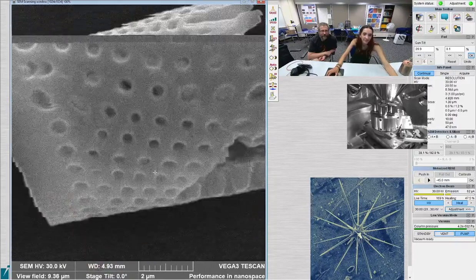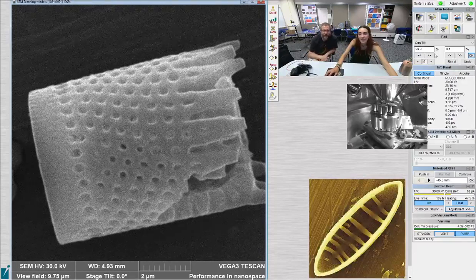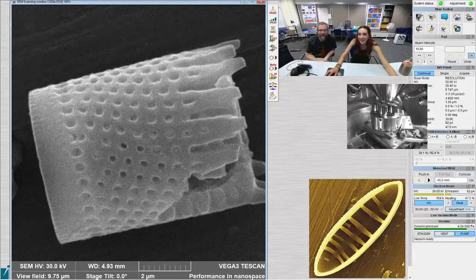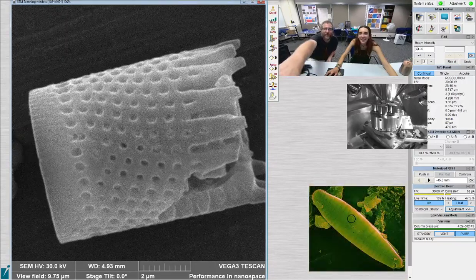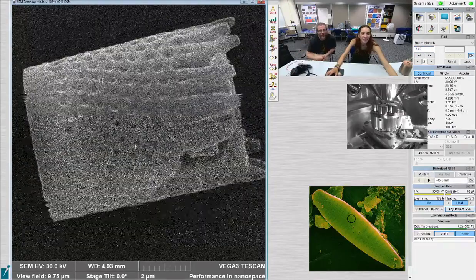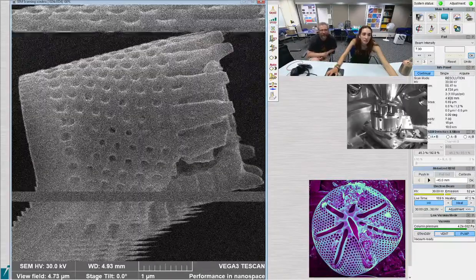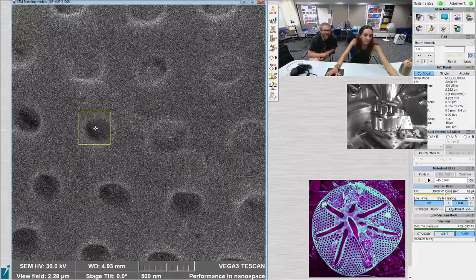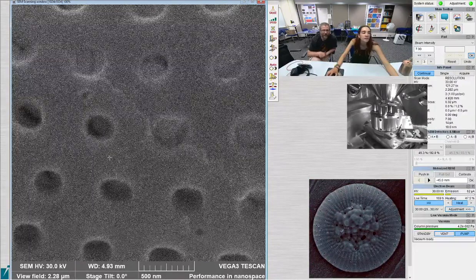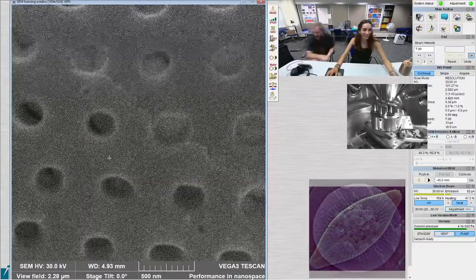Better. Definitely better. Also, the beam intensity is currently at 10. If you set it to 7... No, just click right there where the 10 is, and then change it to 7. Yeah, that'll improve the image quality. 10's okay if you're zoomed way out and something's huge, but if you're looking at small things that are a couple microns across, you probably want to. That's good. If you wanted to stigmate it from that, you probably could, although it's not going to be easy, because there's not a bunch of little things that you can easily focus.